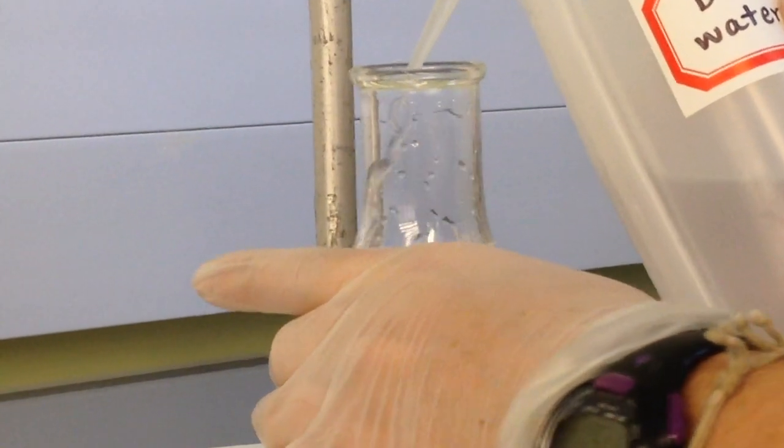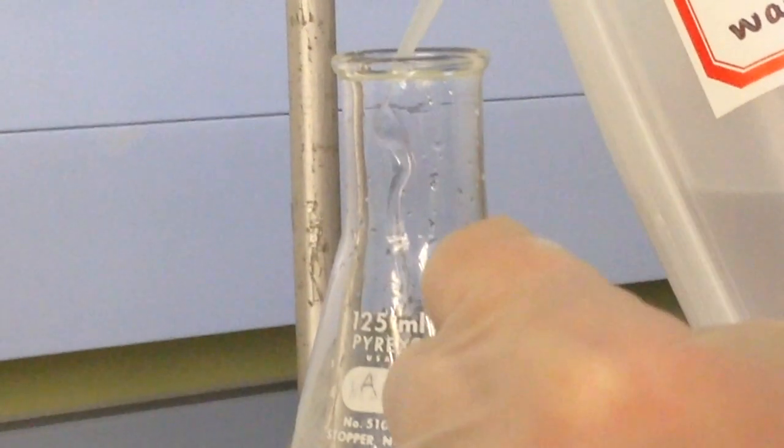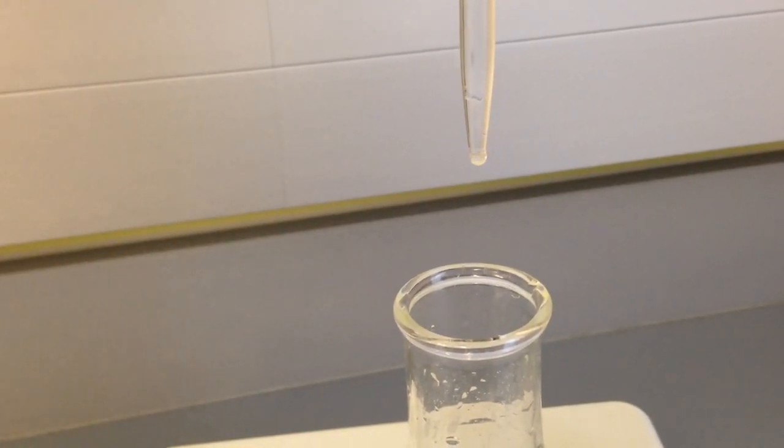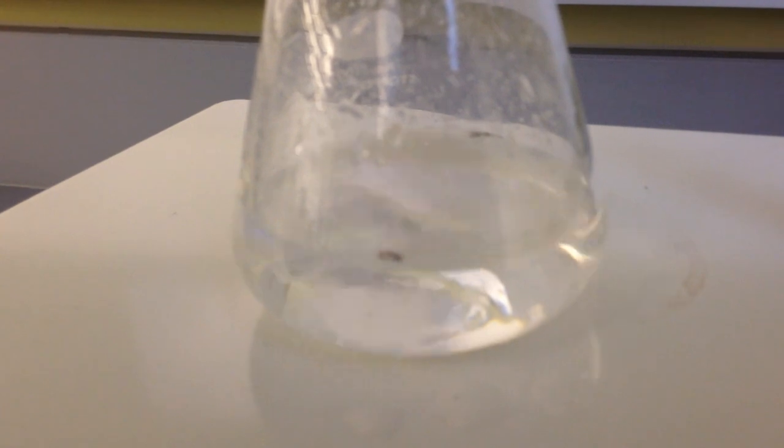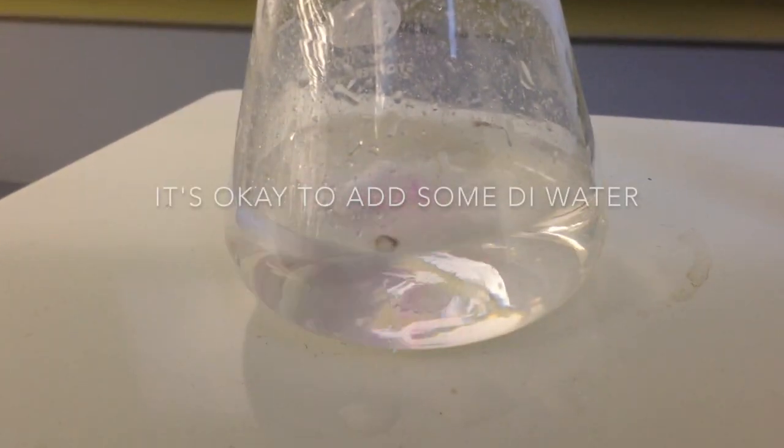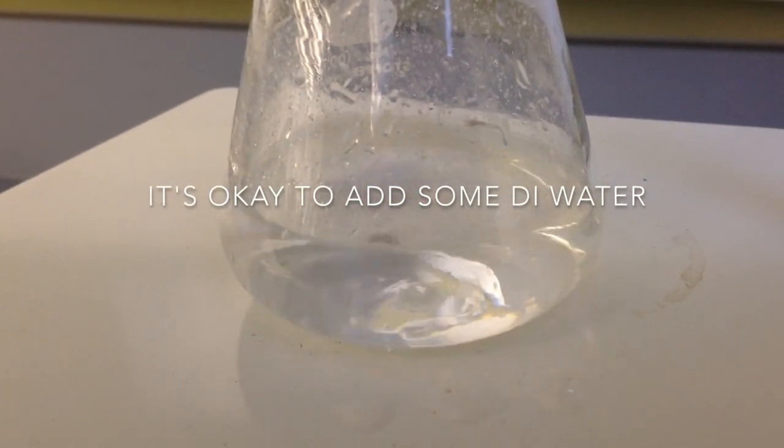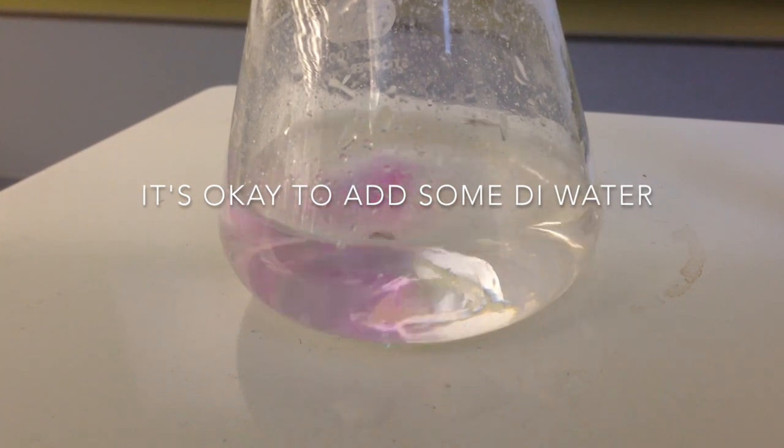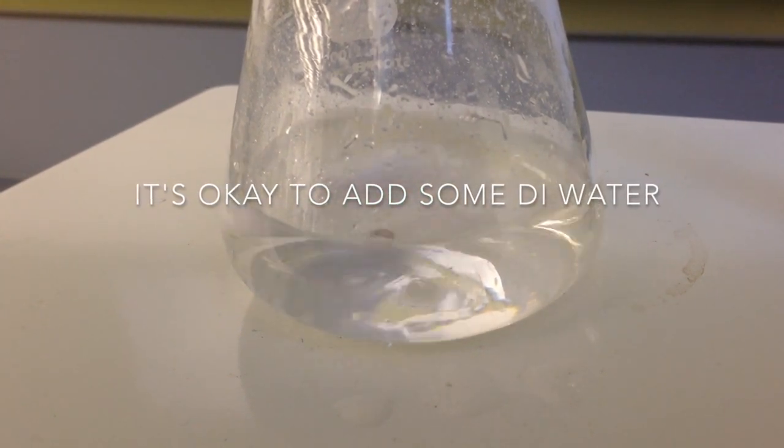Rinse the flask with a few milliliters of deionized water between drops to ensure all the sample remains in solution, because minimal splashing may occur. Don't worry about putting DI water in the sample, because DI water does not affect the molar ratio of the titrant and your sample.